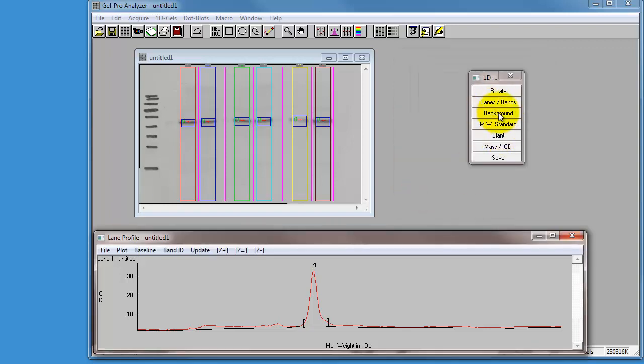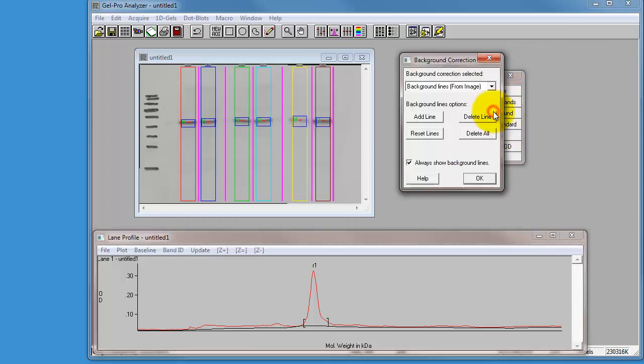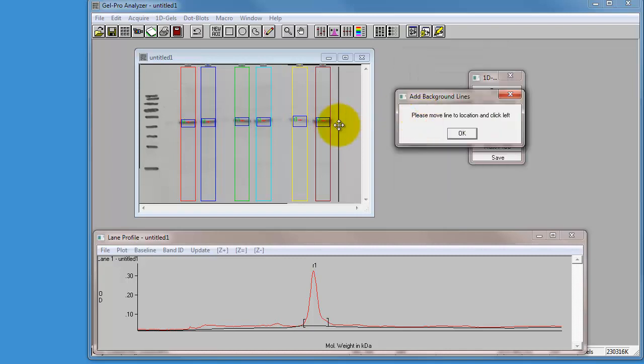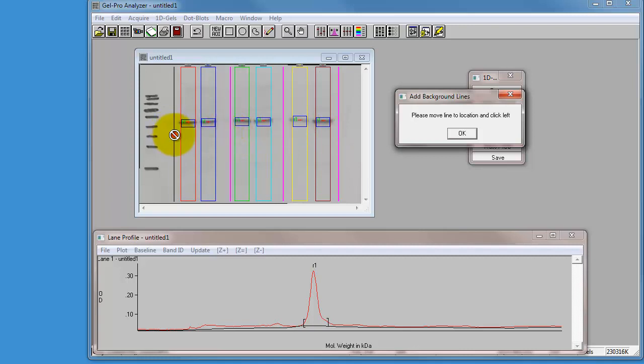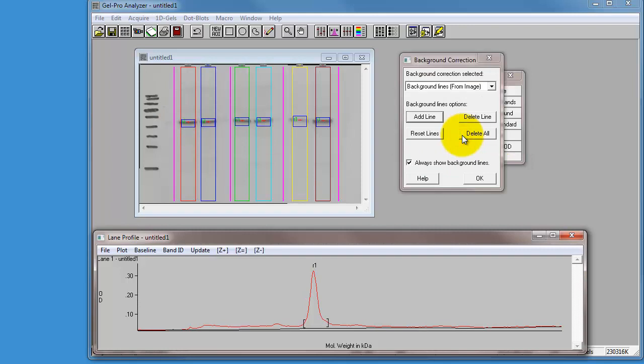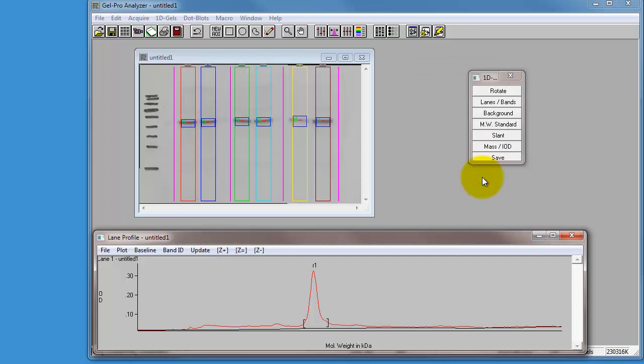And the next one in the list is background. I'm just going to delete all the background lanes and add my own lines. So I'm going to add lines in between the lanes of my western. You may find if you've run lots of lanes, you don't have access to the between lane lines, so just add a background at the beginning and the end, and that helps the software get that right. And then just press OK. That sorted that out for me.